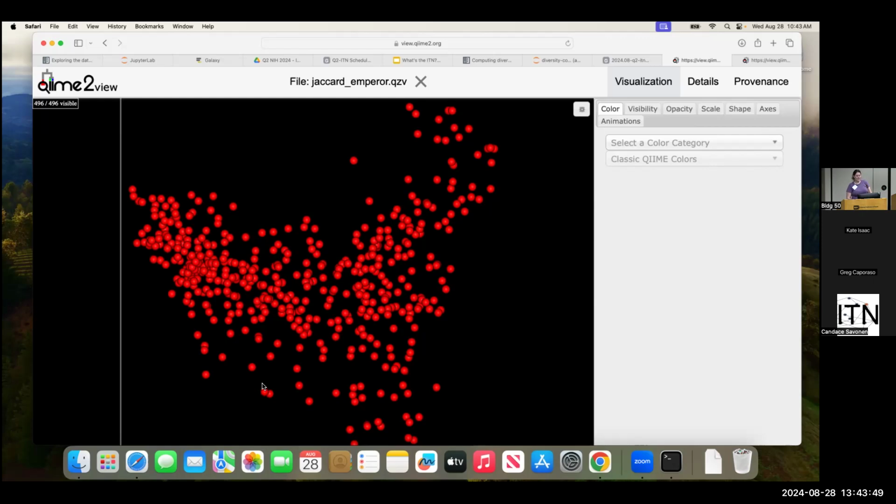Yeah, they must have a pretty similar beta diversity to each other because they look really similar. And they aren't the same subject at all. So that's just two people that have the same similar gut microbiome. But this doesn't exactly tell us how similar they are. They're just pretty similar to each other relative to all of the rest of the data, which is important to note.